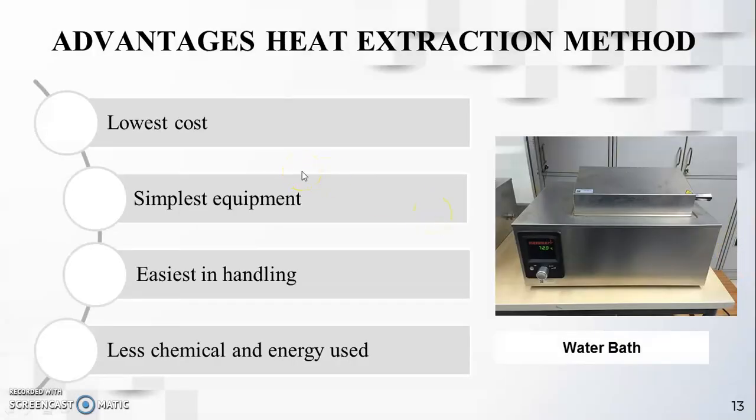Next is advantages of heat extraction method. I prefer heat extraction method because it is lowest in cost, simplest in equipment, easiest in handling, and uses less chemical and energy compared to other methods. So, this is an example of the water bath I used in my experiment.